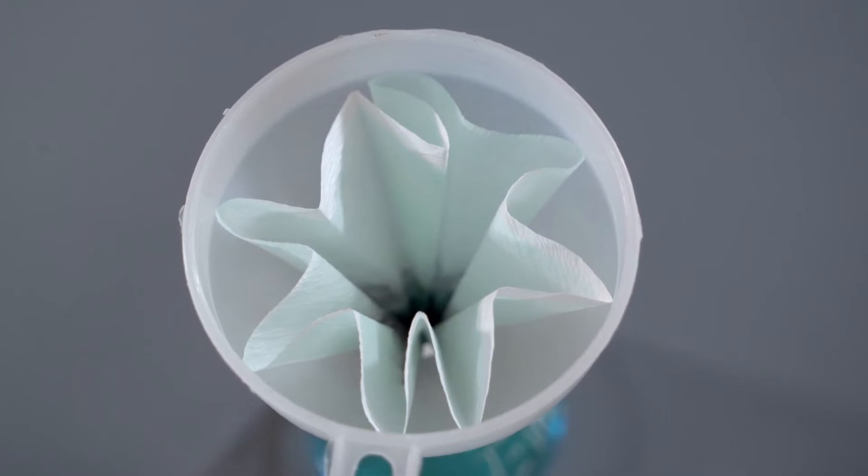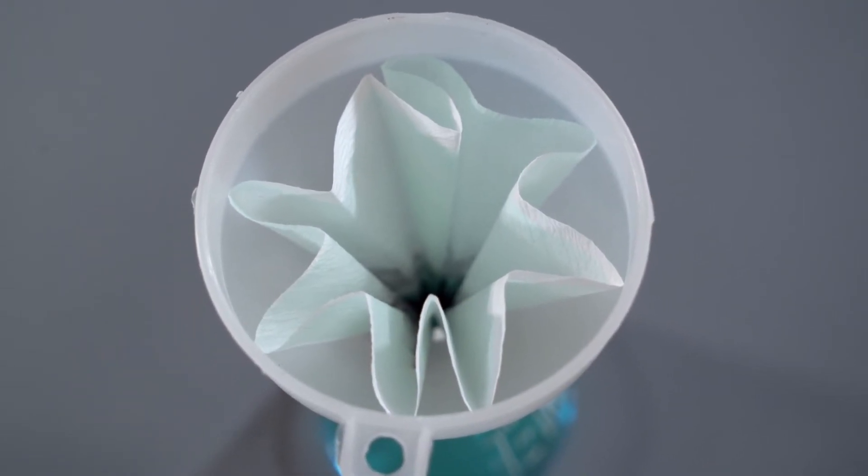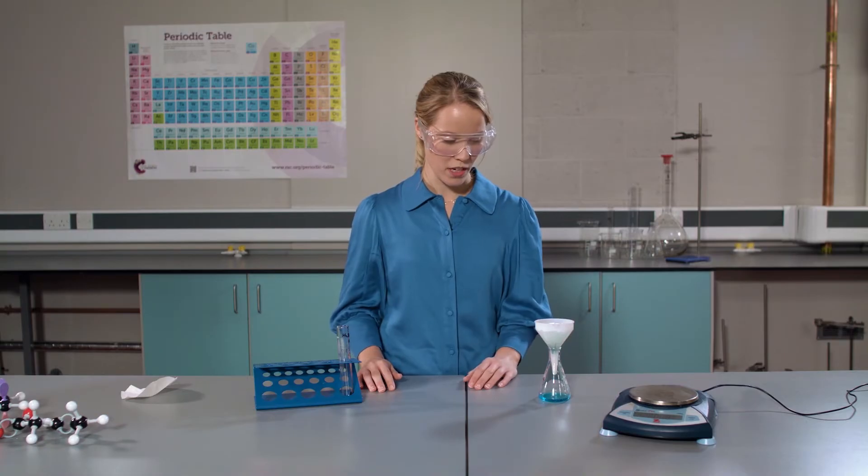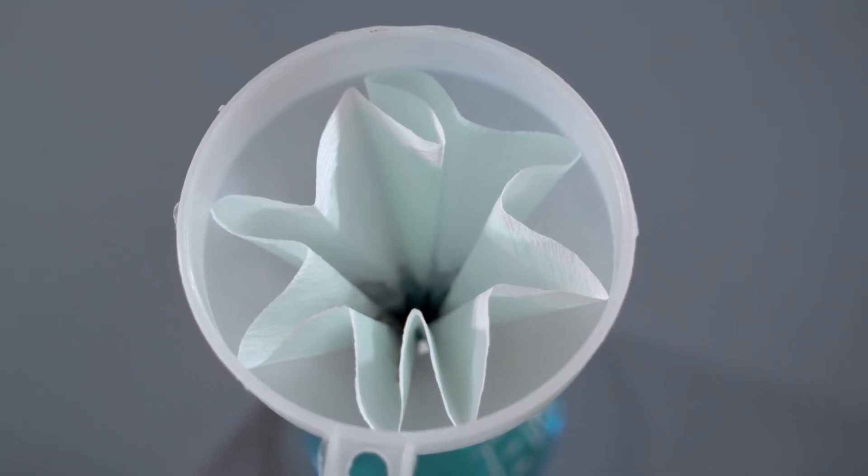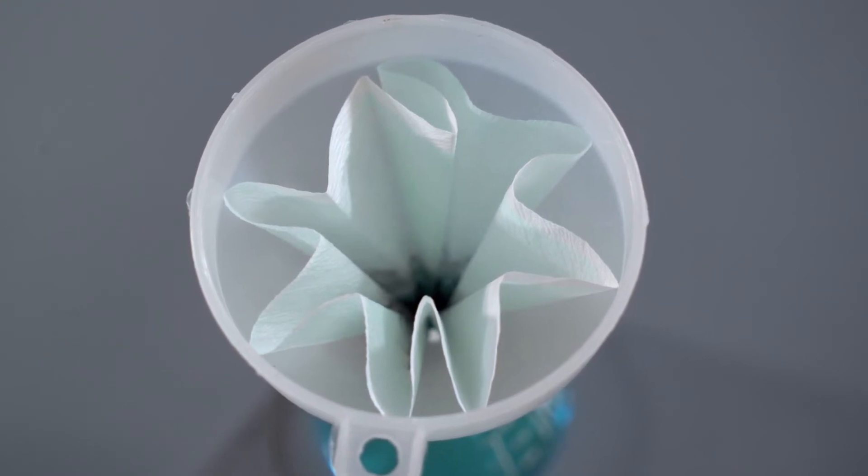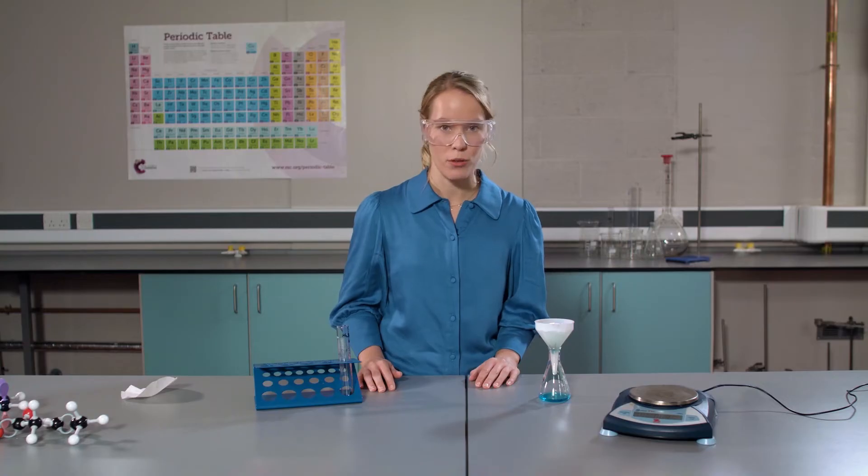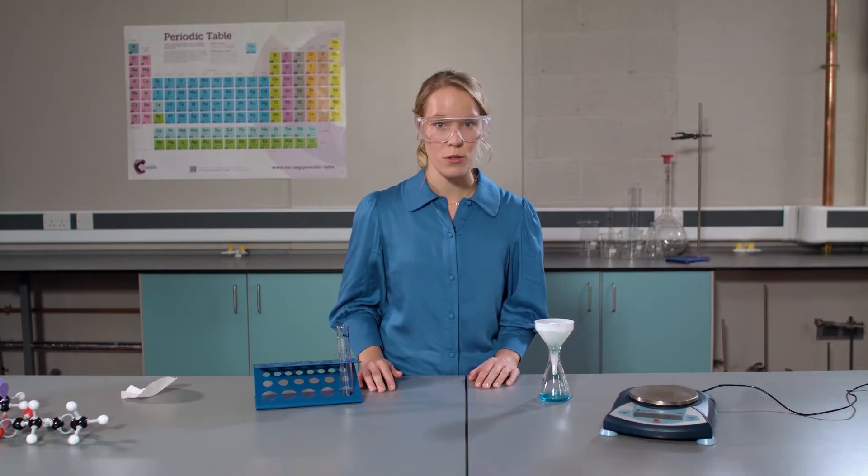The copper sulfate solution is now dripping through the filter paper, down the filter funnel, into the conical flask, and inside the filter paper we can see some black copper oxide. The copper oxide is insoluble so cannot go through the filter paper. This is called the residue.